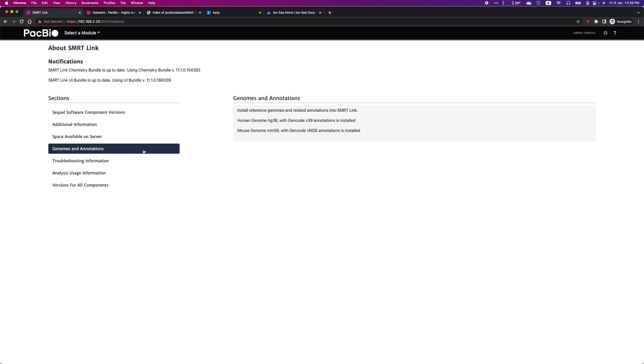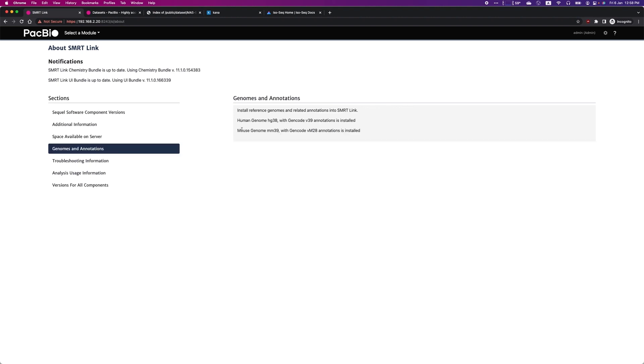Under Genomes and Annotations, you can see that I have already downloaded both the Human Genome and Mouse Genome reference and annotations database, which are by default supported by SmartLink 11.1.